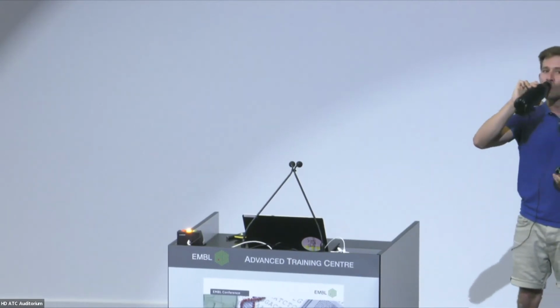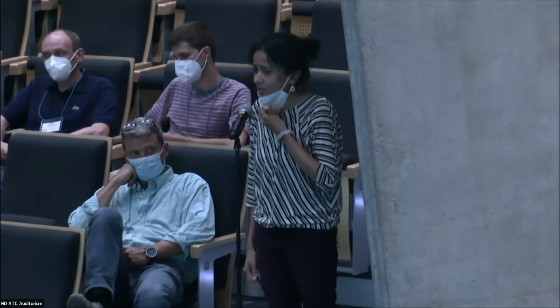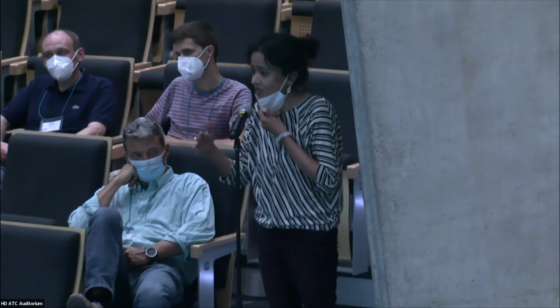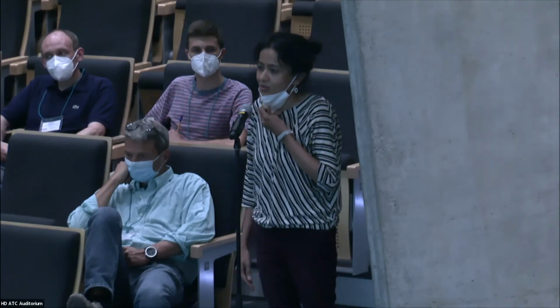Hey, Ani Basu from University of Chicago. Great system. I have a couple of questions. One is, do you have enough mucins covering your cells? Are your goblet cells actively producing mucin? And if they are, are they providing some sort of protection against the strong pH conditions? And the second one is, do you have a disease model for this?